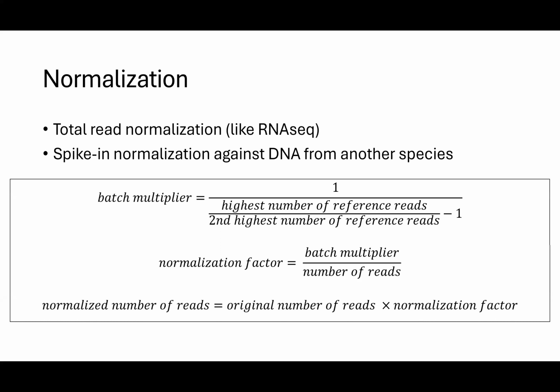So I haven't actually tried that, like if you can add the spike-in normalization, but they suggest that that is a way that some older data sets could be better normalized when people hadn't had those controls.